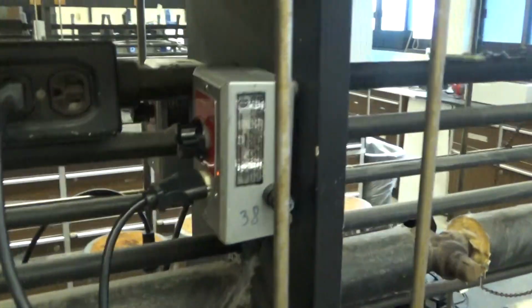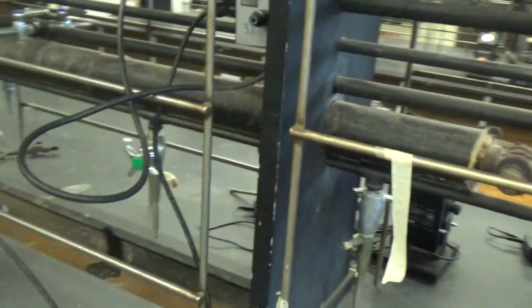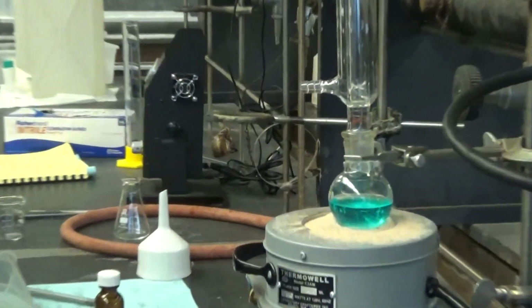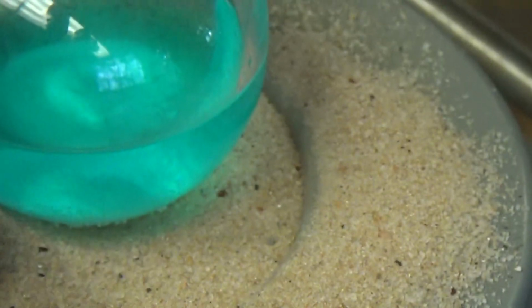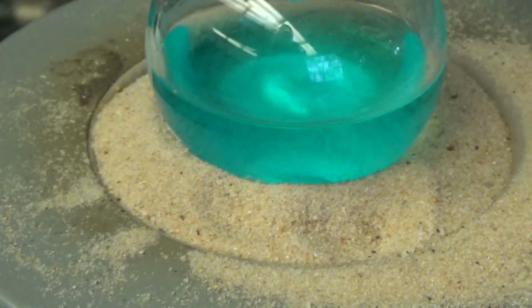And what's your setting roughly? I'll put that at about 6. Okay. And do you want it to boil? Yes, we want to boil it up for about 25 minutes. And the sand, maybe we should put a little bit of sand around for a nice contact. There we go. Sand touches.